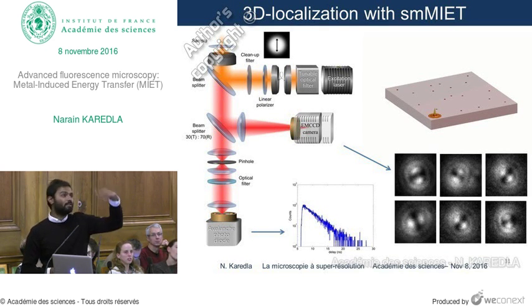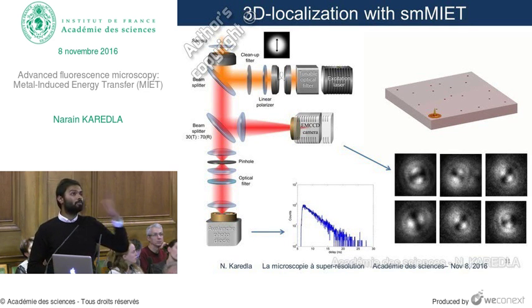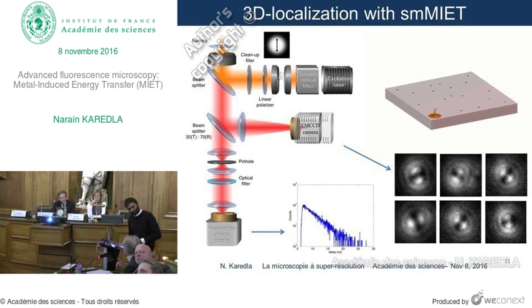You can tune this. You can select a different metal layer, for example. You could go to blue wavelengths, where the curve is much steeper, and then you can resolve fluctuations at different distances from the surface. No, that I understand, but my question was about the intensity. Your experimental result. The amplitude, yeah.